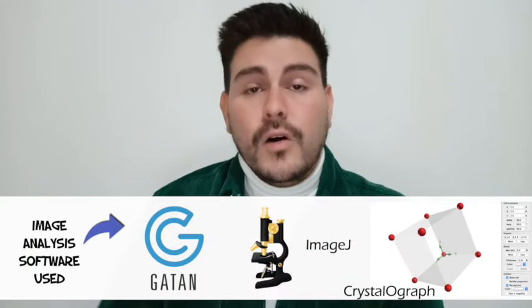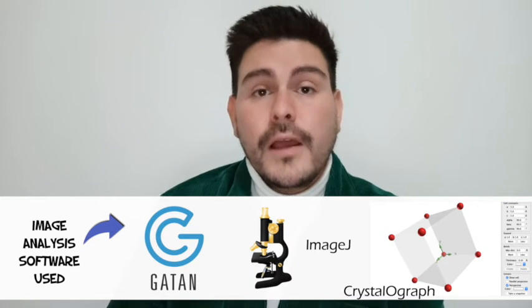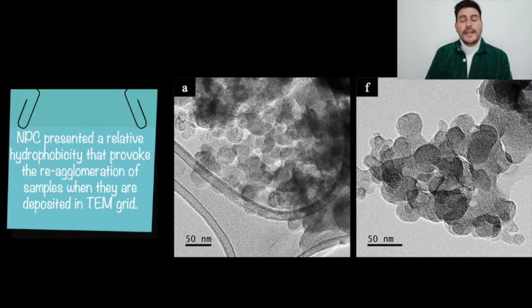In the case of the simulation and also the calculation from the micrograph, we use 3 different image analysis software. Following the methodology that we show in the experimental part, we obtain the following results. In the first case, we can see the image on the right side of the screen. As you can see, they are the images of the cellulose nanoparticles from garlic and from agave.